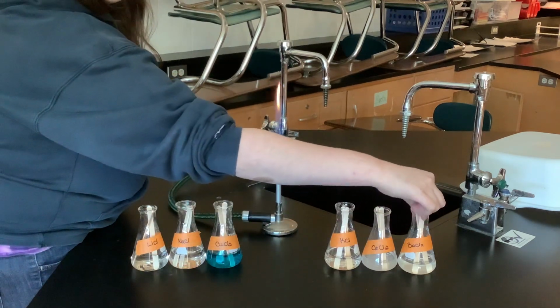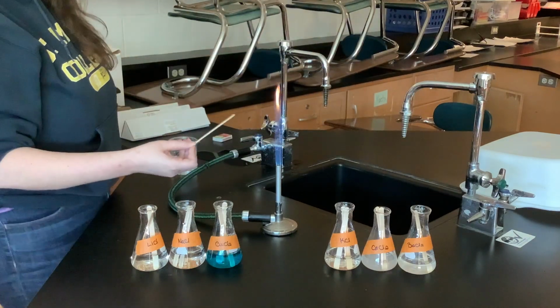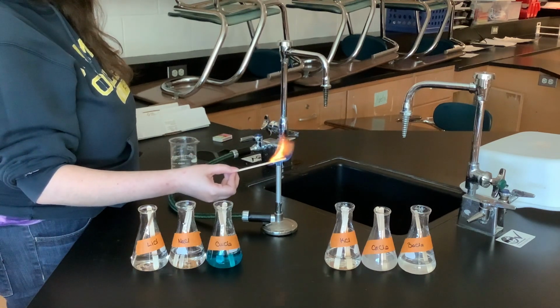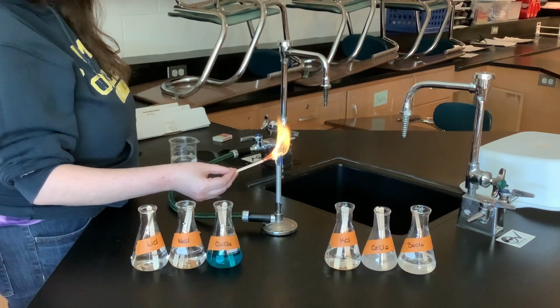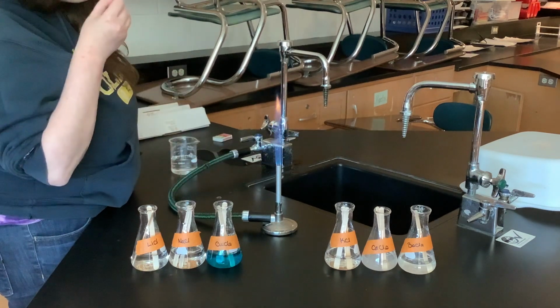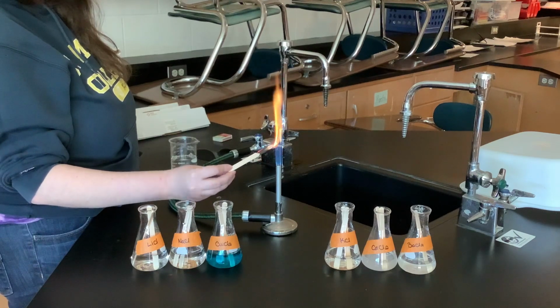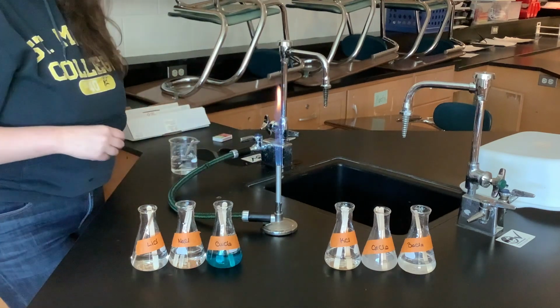Okay, so the first one we are gonna start with is barium. Make sure you are watching and writing down what you're supposed to write down when you see the colors. So this one's barium. Notice that it took a second to get started, but hopefully you can see that is not the blue and orange that it started out as. I'm trying to burn just the end of the stick that's covered in the chemicals and not the stick itself. All right, so that was barium.